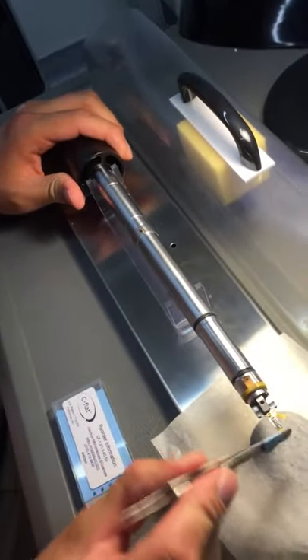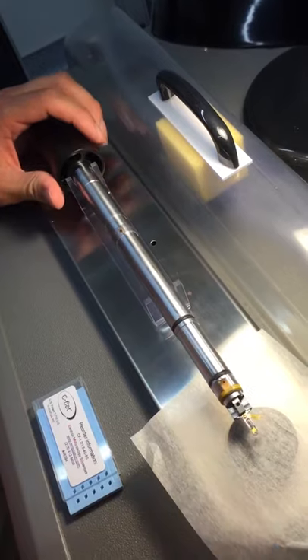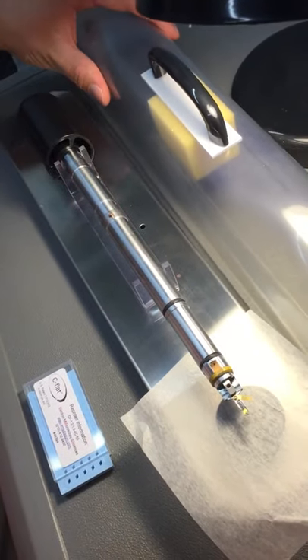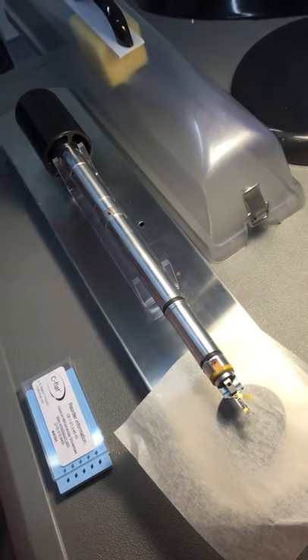Get it in the slots — 10 seconds. They're done.